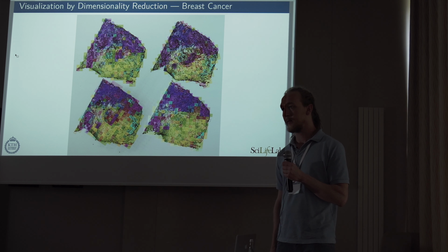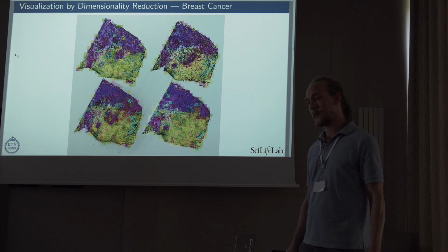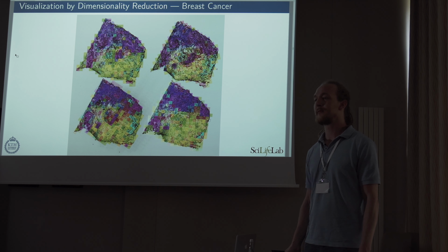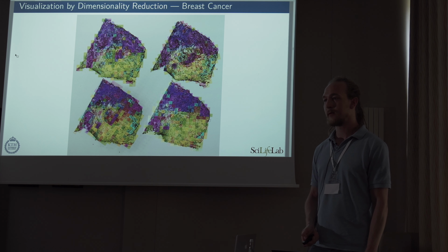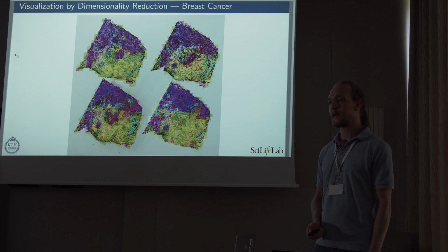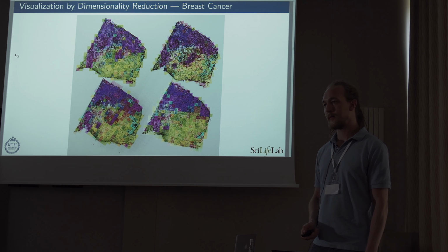So when you analyze this data, do you have batch effects, like that each slide will have some biases? Also, even inside each area, do you have something around the borders? That's often the case if you do an experiment, that somehow on the borders there is some different effect, or between each slice and so on?